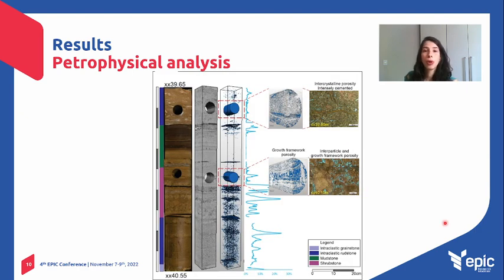And another result was the CT scans of the core, which was able to segment and calculate the porosity that ranged in each interval between 1 and 5%. It's lower than the CT of the plugs because of the limit of resolution. The vertical profile is characterized by high porosity peaks that are a few centimeters thick, intercalated with low porosity zones. The peaks of porosity are usually linked with intraclastic rudstone lithology and shrub-dominated lithology that happens when depositional control is dominant.